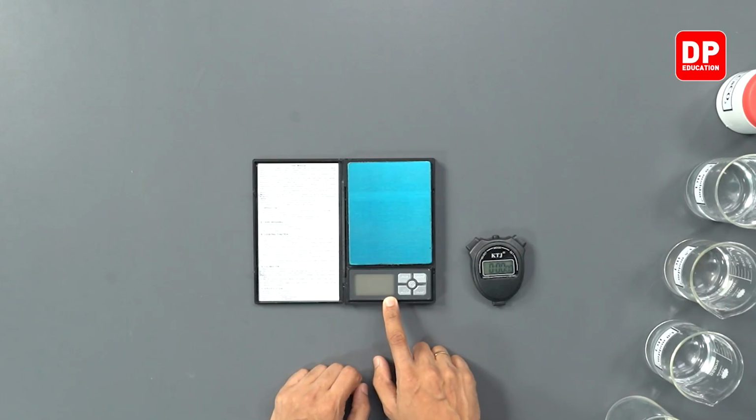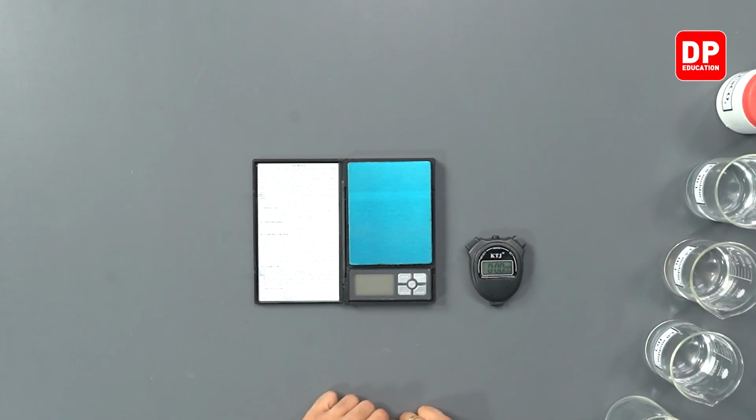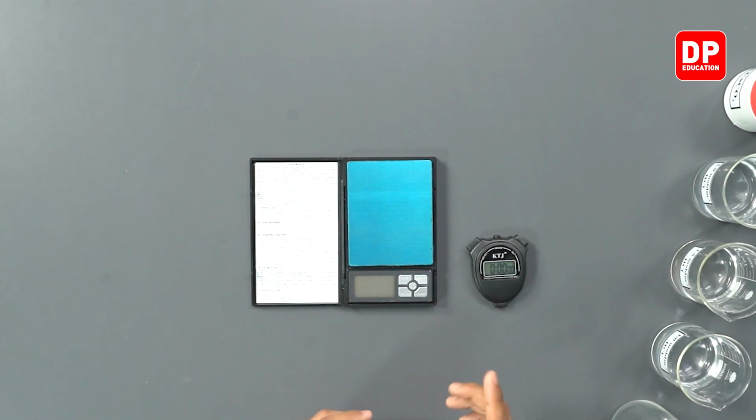Apart from this, we'll be using this equipment as well. Over here we have a digital balance, and we'll be using a stopwatch as well to obtain the mass readings at 20-second intervals. We'll be using the digital balance as well as the stopwatch to obtain the mass readings at specific time intervals. Now, without further ado, let's move on to actually conducting this experiment.